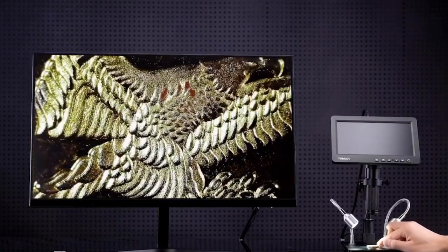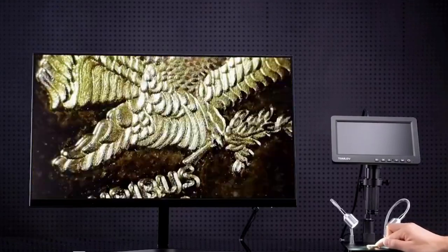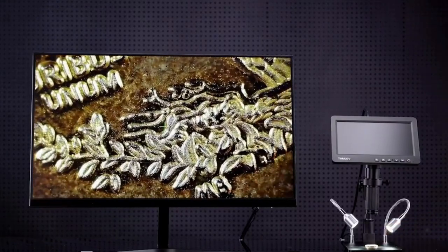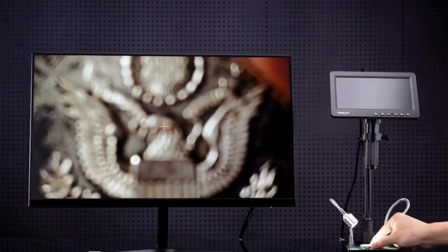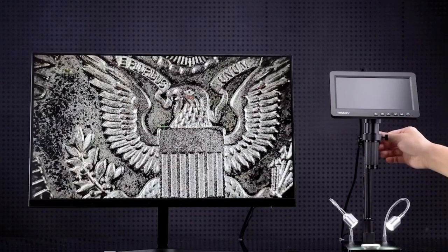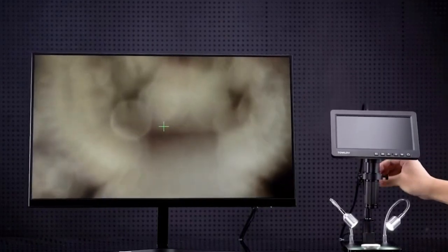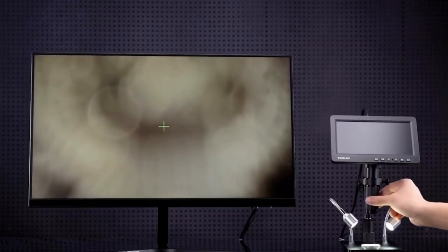The DM209 is designed to seamlessly integrate into your setup. You can connect it to an HDMI monitor for an awe-inspiring visual experience. Plus, it's compatible with trinocular microscopes, enhancing the quality of your observations. The inclusion of a 1-inch C-mount facilitates a comprehensive view, making collaboration and sharing easier than ever.